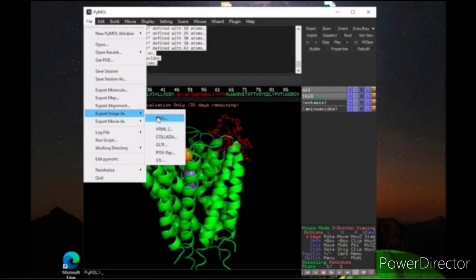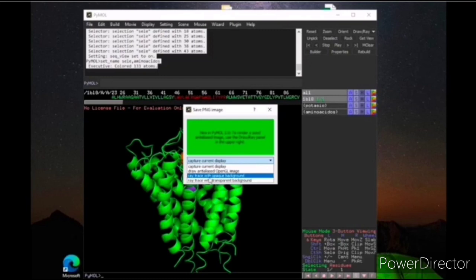The input order of the save argument is: PyMol save, path, file name, selection, state, format. It is very important to separate the command arguments. Path and file name: this is the information needed for PyMol to save the file to a desired location.